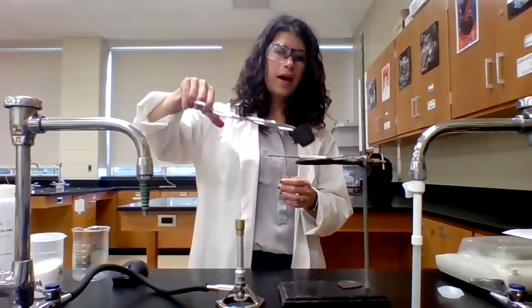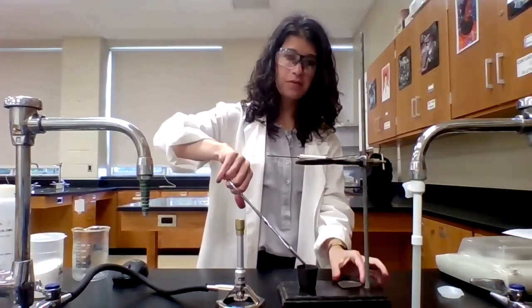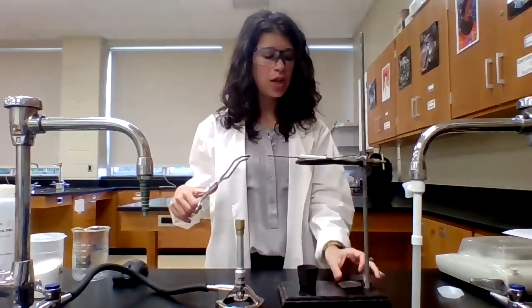Now, I don't want to touch the crucible. It's going to be hot, so I'm going to use my crucible tongs. And I'm going to let this cool on the base of the ring stand. You never want to put it on the bench top because you could burn the bench top. So the base of the ring stand is where you want to let it cool.